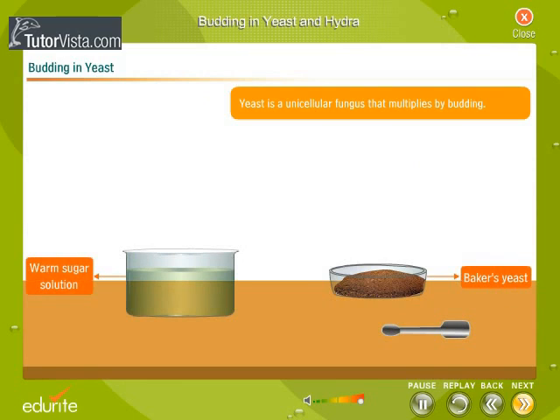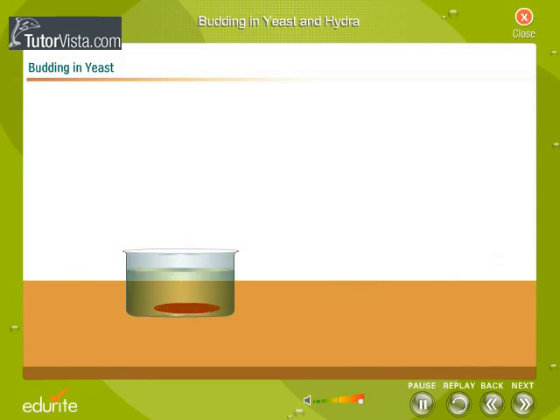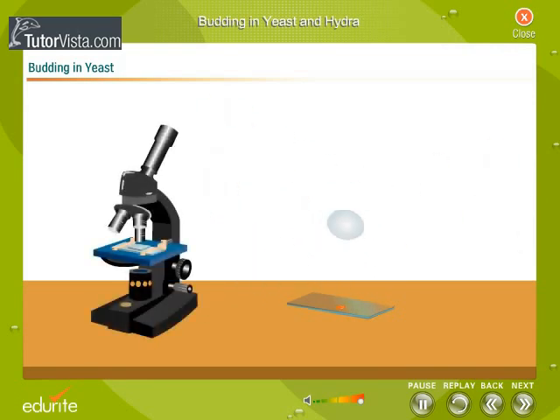Yeast is a unicellular fungus that multiplies by budding. Let's perform an experiment to observe this. Put some baker's yeast in warm sugar solution and leave it undisturbed for 2 to 3 hours.